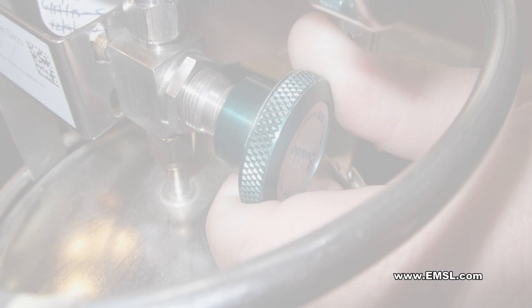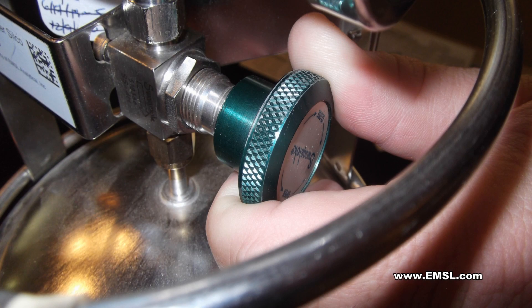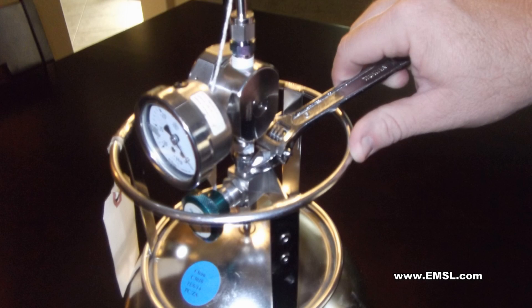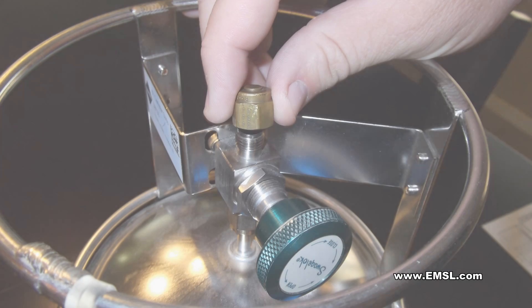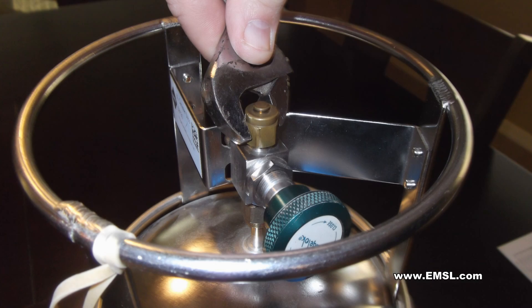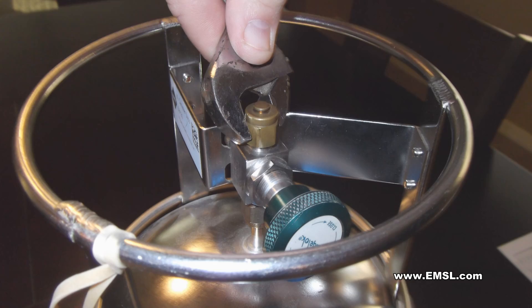After the sampling time has elapsed, stop sampling by closing the valve on the canister by turning the knob clockwise. Remove the regulator using the 9/16-inch wrench and place the 1/4-inch brass cap back on the canister with the wrench until it is snug, again being careful not to cross-thread the nut.